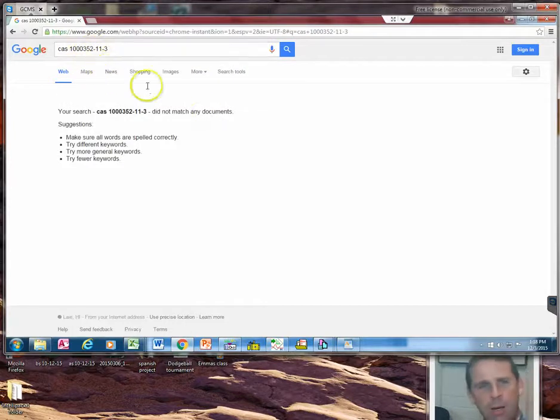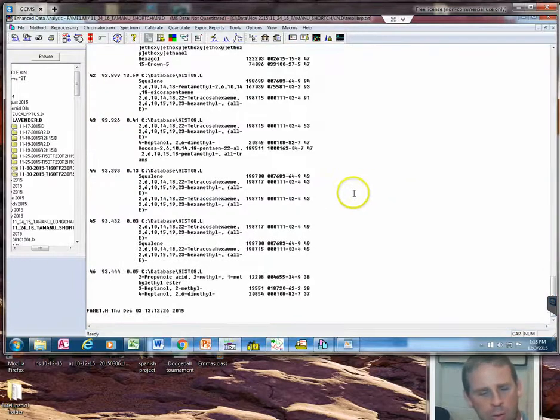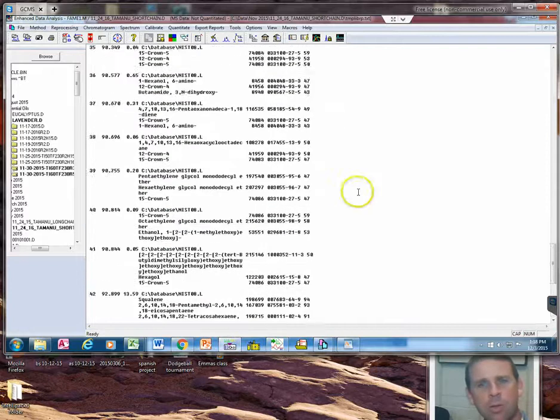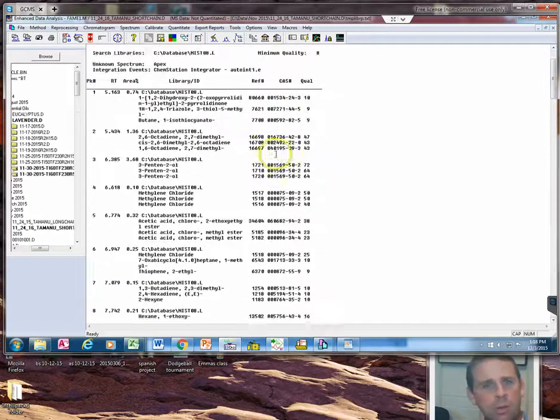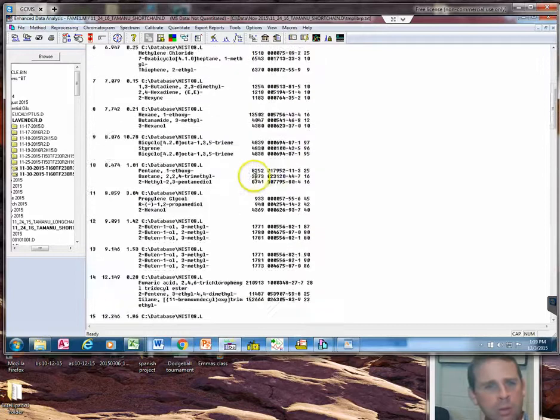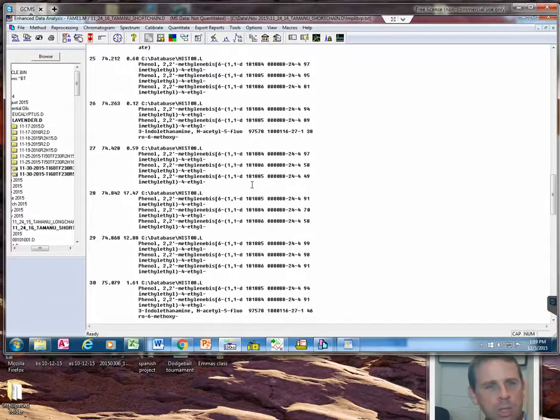A way we could find out is to take this value, Control C, copy it, and then go back to this report, and then in this report, click Control F. Does this have a search function? That one doesn't have a search function, does it? And we can just try to scroll through here and see if we can find what that 22222 thing is.